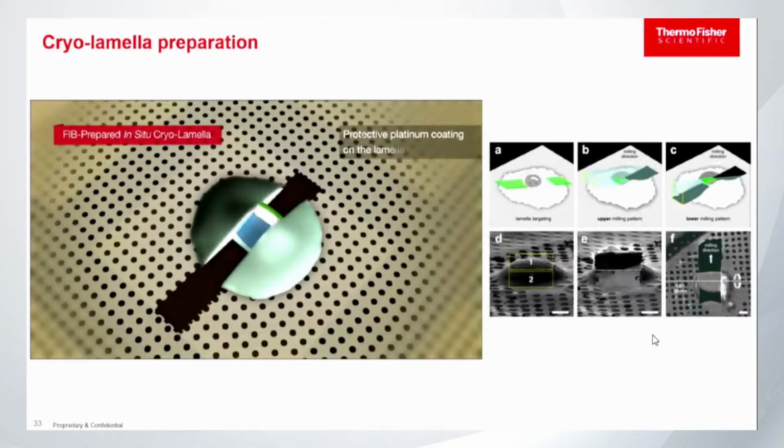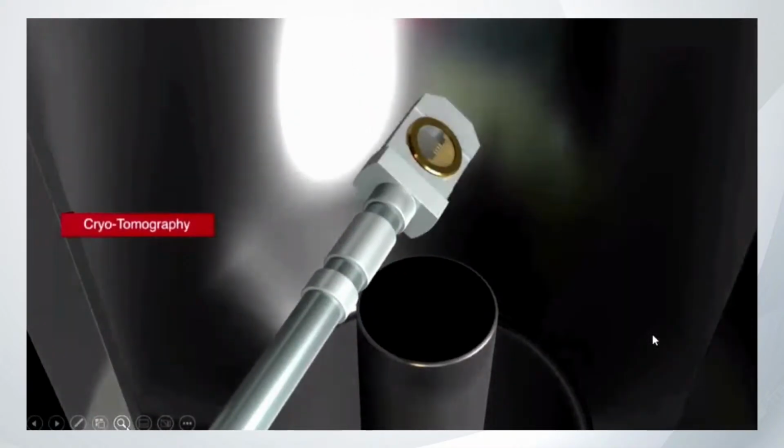Right now, we have an integrated fluorescence light microscope that can help you with that, because you can go back and forth to localize: okay, I am milling the area, I am still in the good area of interest where my protein is. If you can see the fluorescence, good to go. And you can mill in, and mill in, and mill in. You can go back and forth to verify and double check, triple check if you want, that you have the area of interest in that lamella. So you are not doing the milling blind anymore. That's super convenient.